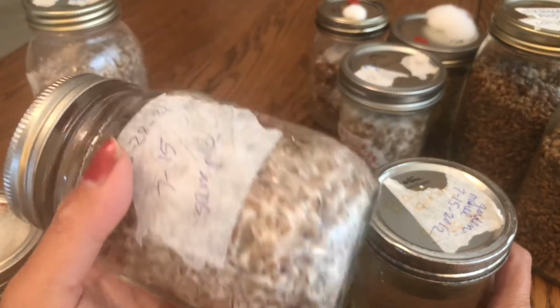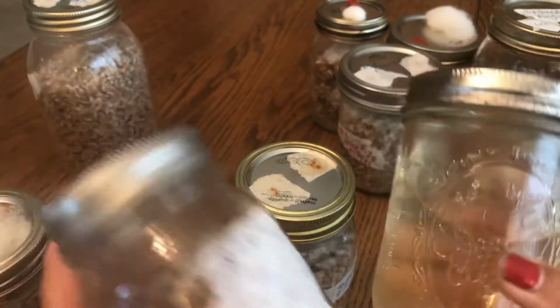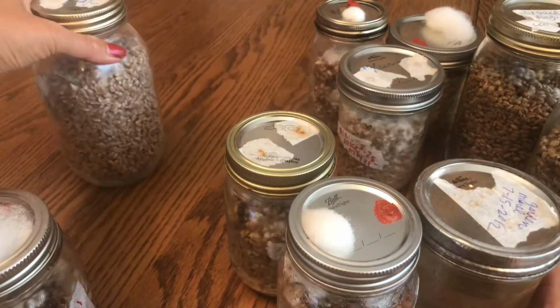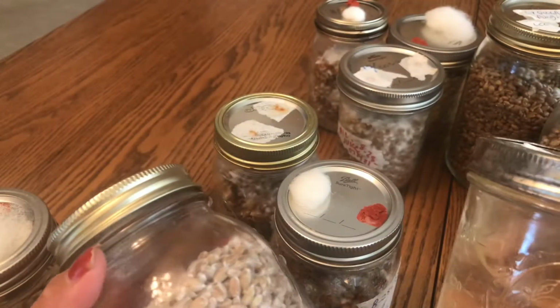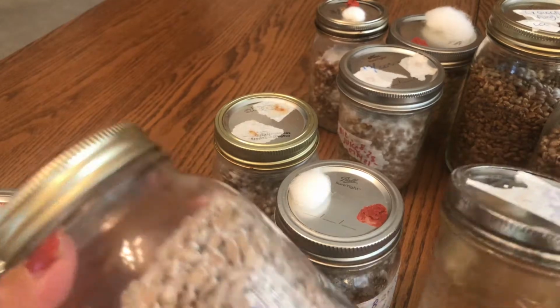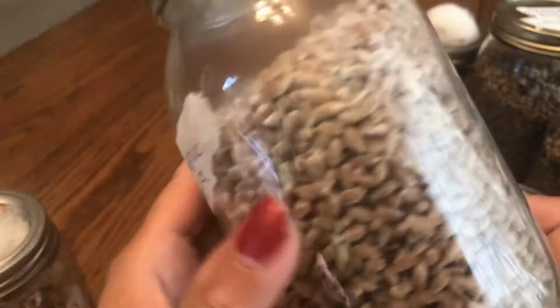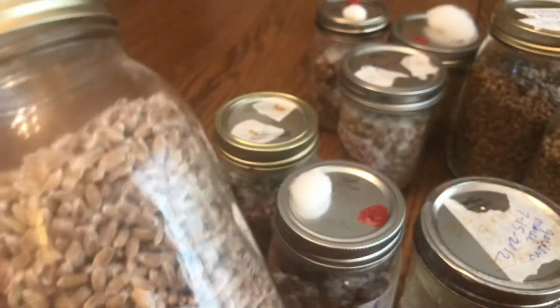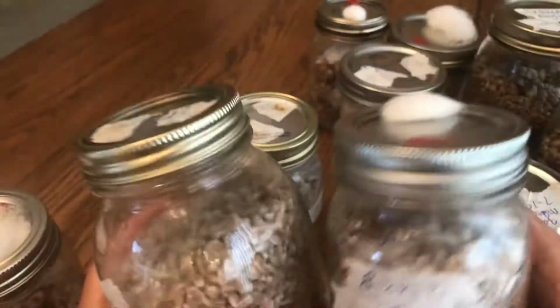The same as this one. It's from the same liquid spore. This one, the same thing from the same liquid spore, but because it's a little bigger, it seems like it's forming, but it's not as fast as this one. Let's see.